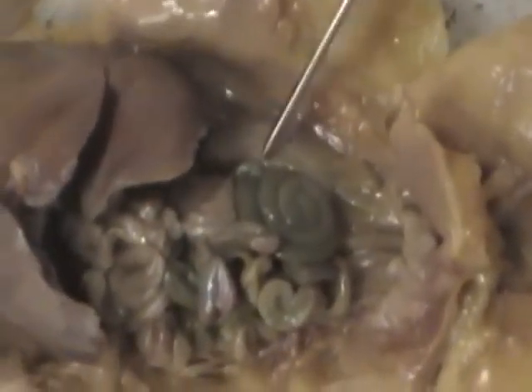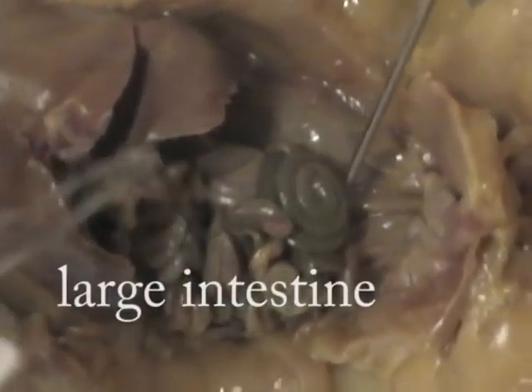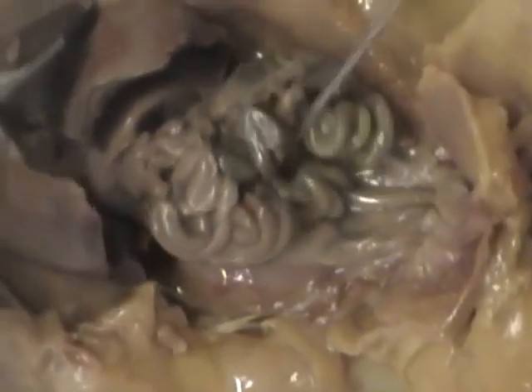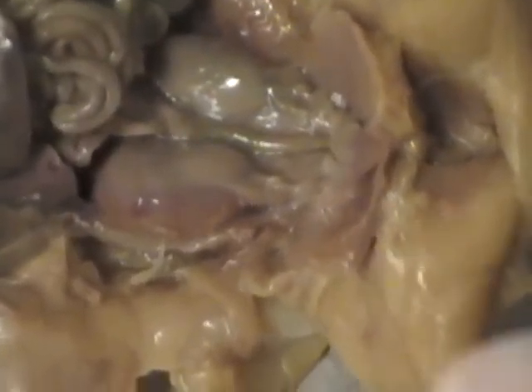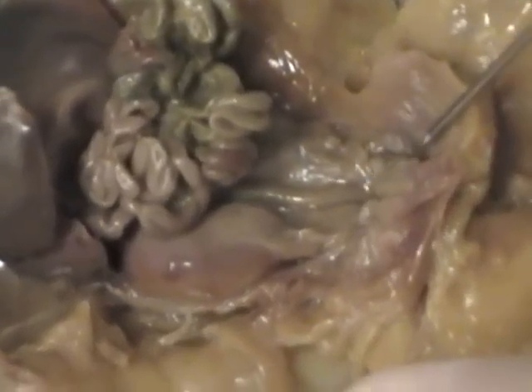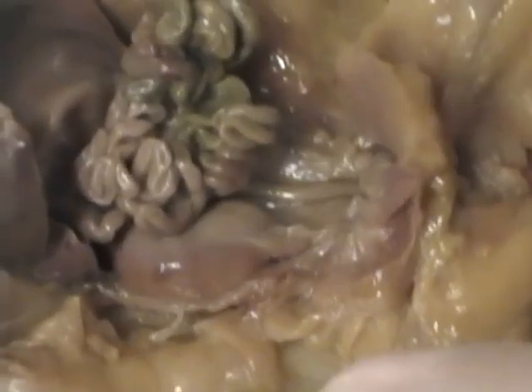And then around here, that kind of greenish is the large intestine. It's bigger than all the rest. These two things are the kidneys, right there and right there. So this would lead to the bladder, which we can't see right now, but it's a little more in this area.